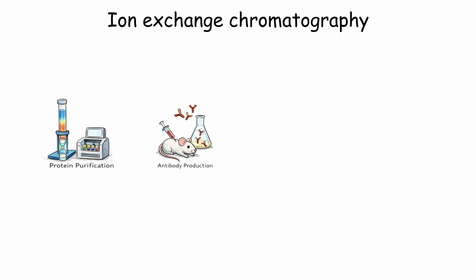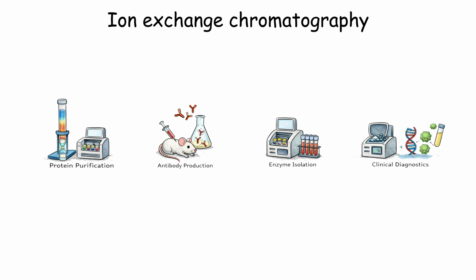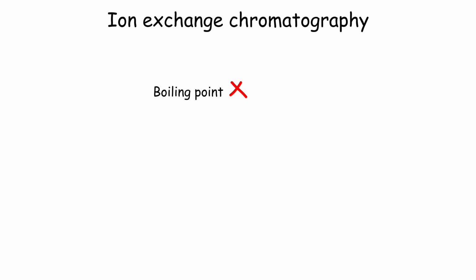That level of precision is why ion exchange chromatography is one of the most widely used techniques in protein purification, antibody production, enzyme isolation, and clinical diagnostics. Here, separation is not about boiling point. It is not about size. It is purely about electrical attraction.